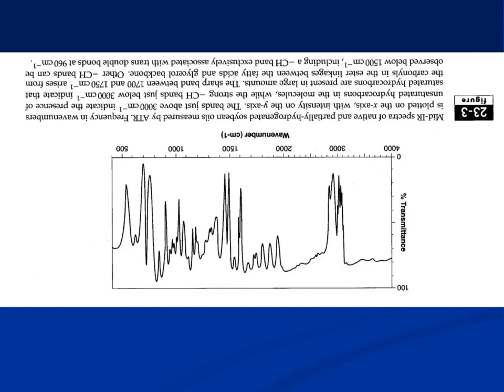It looks very different. But say this is the part where H2O or OH groups will show up. So you can look at the table. Each peak is because of some vibration of the molecule. If you know that this peak belongs to CO, or this peak belongs to a CH stretch, or this belongs to H2O, you can write down which kinds of stretches or vibrations you see in this spectrum.